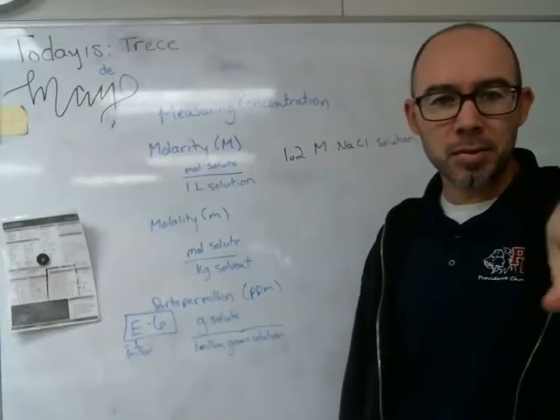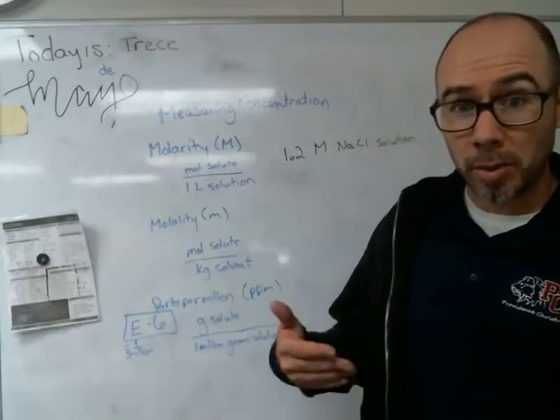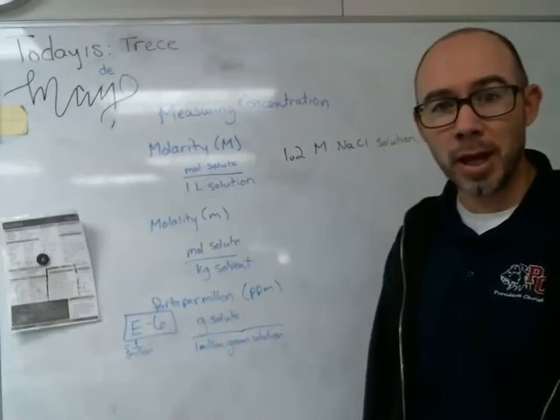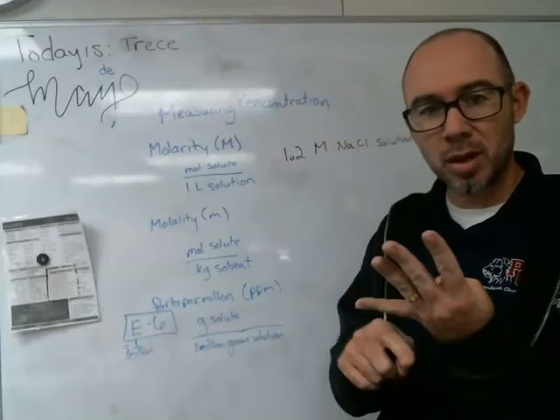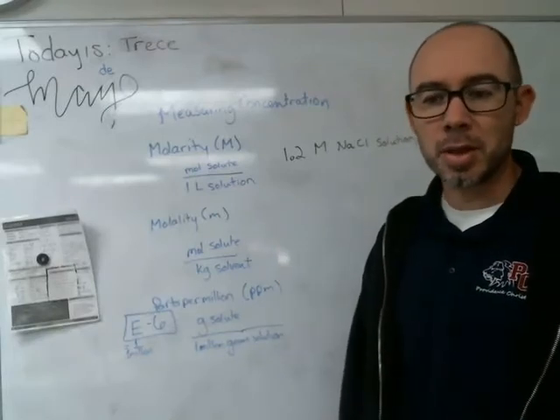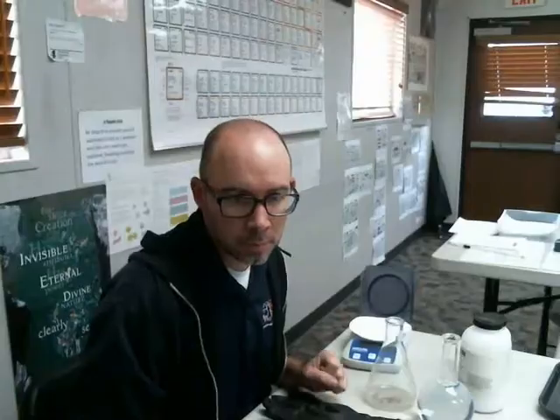Okay, I'm going to turn things around here and set up my table, and I'll demonstrate for you the way that I would go about doing one of these types of problems as I get things ready for you for the lab. Acids, bases, salts. We're going to combine stuff and get precipitates. We're going to see how these things react. They got to be in the right proportions. So let me get that set up and demonstrate how I do my work.